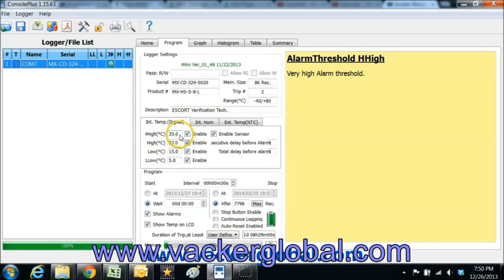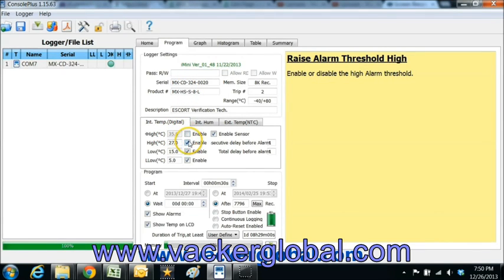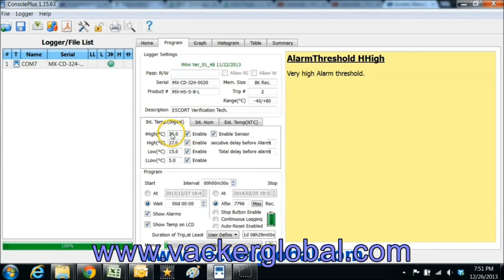Over here you can set four levels of temperature threshold levels. You can enable or disable the alarms, set the value of the alert levels, etc.